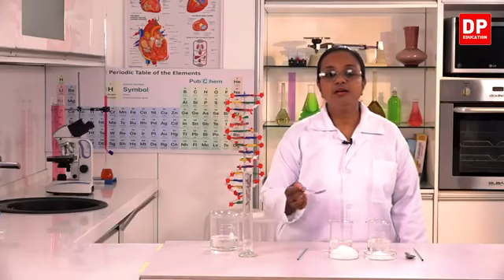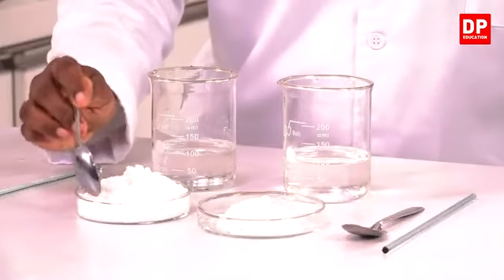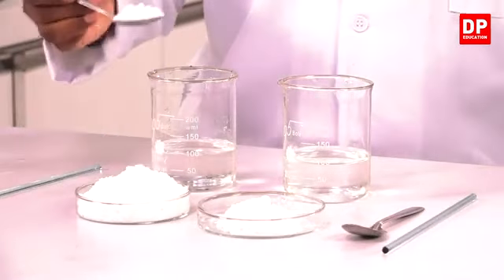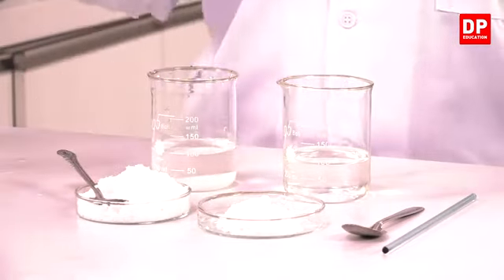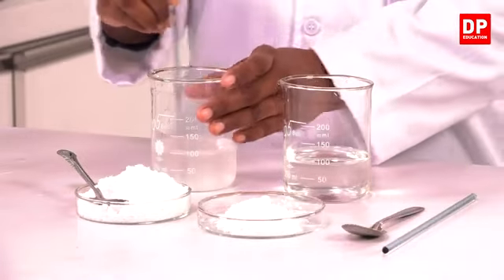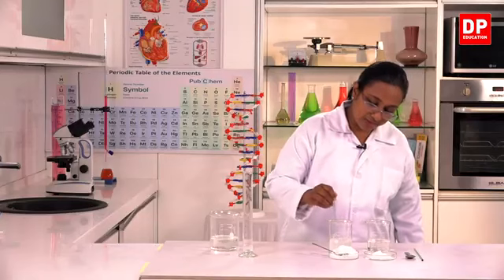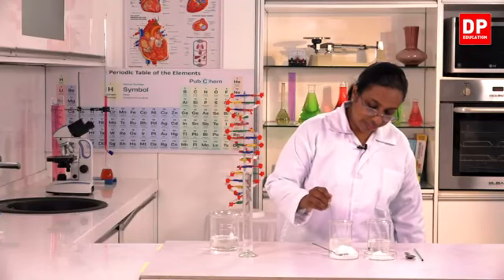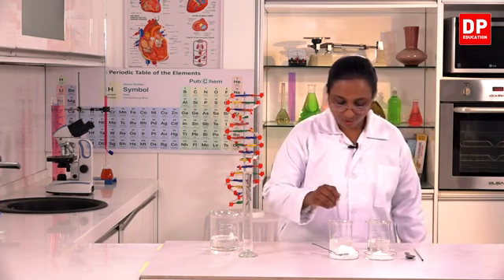So to the first beaker, I will add sodium chloride. So I'll take 1 teaspoonful of sodium chloride. We will dissolve it well. You all are familiar with this observation. You know that sodium chloride can dissolve well in water.